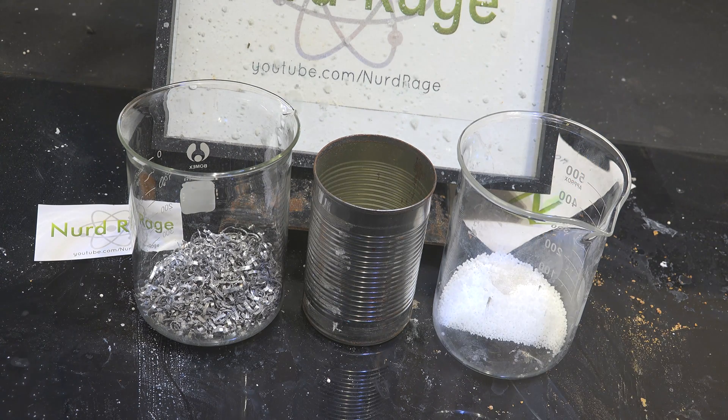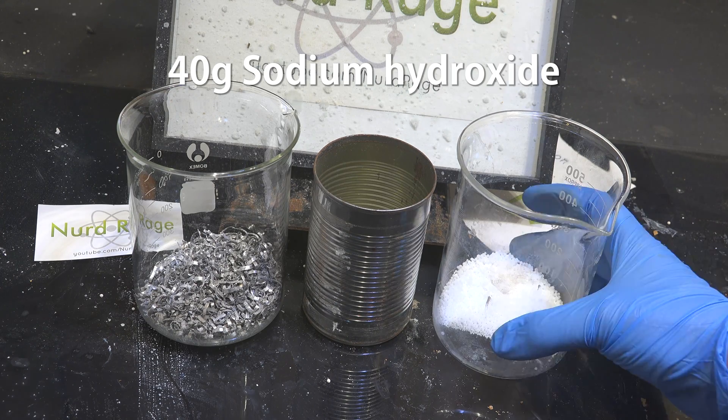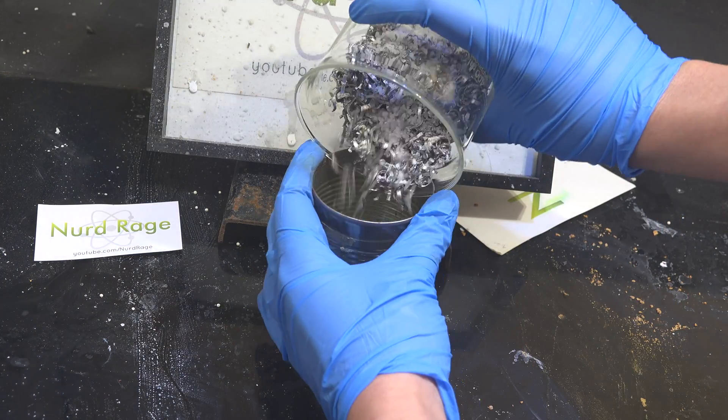Now we're also going to need 40g of sodium hydroxide. This is available as drain cleaner. Thoroughly mix the two chemicals and add them to the steel container.